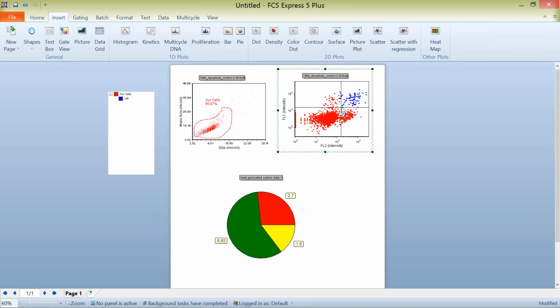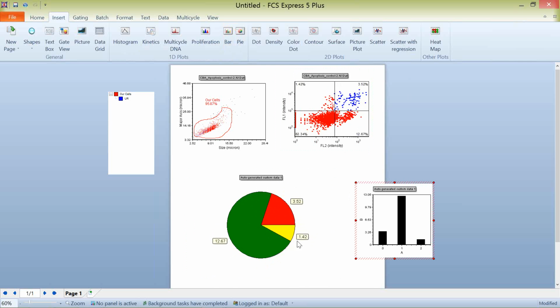And again, since we dragged and dropped these and they're from a statistic on a plot, I guess we have a little Pac-Man going on here, but as we move these, they'll update in real time. And again, the same is going to go for the bar charts. Now that I created a pie chart, it knows the data essentially that I want to put in there. But any new data that you want to add to a bar chart, again, you can just drag it onto the plot.